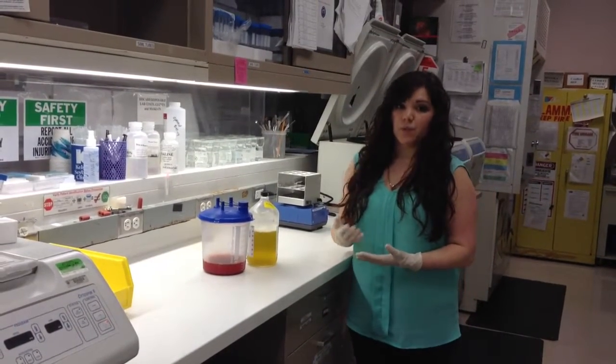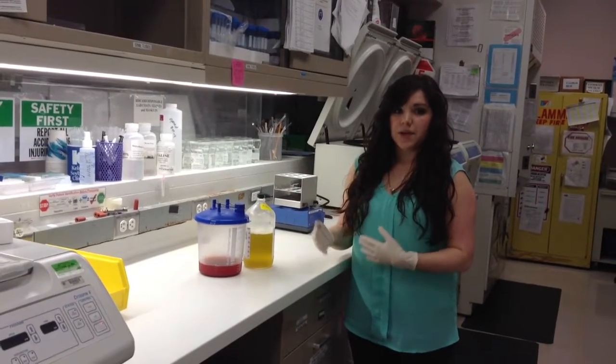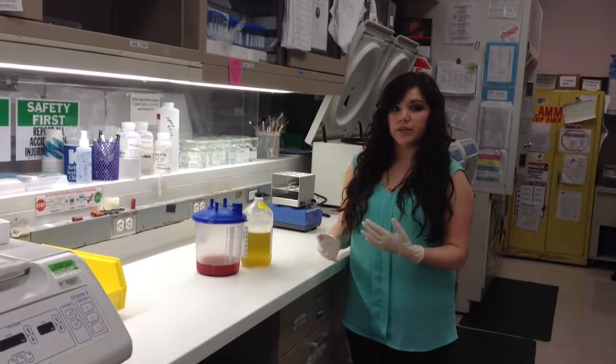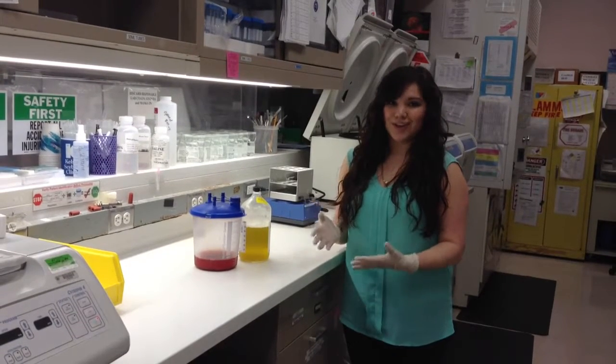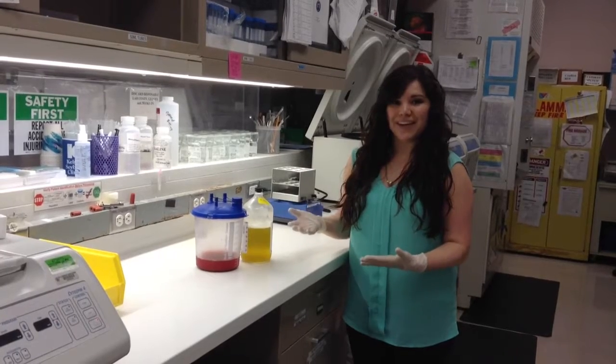I would recommend for the morning time to practice with a few finalized fluids so that the student can become comfortable, because although they've had training in theory, this will be some of their first exposure to the laboratory techniques, and we want to ensure at all points in our rotation that the student is comfortable and in a safe learning environment.